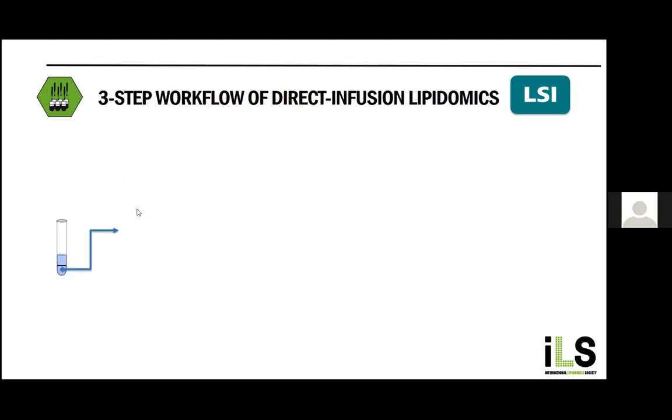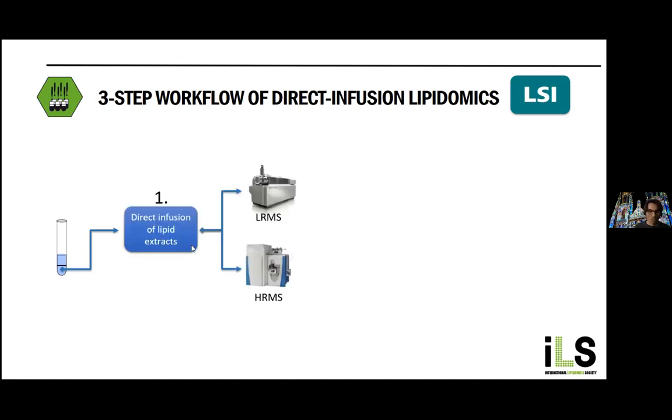As you heard before from Maria, and then also from others, usually a lipidomics workflow has 3 steps. First, extraction. Then we have either an LC or a direct approach coupled to a mass spec.